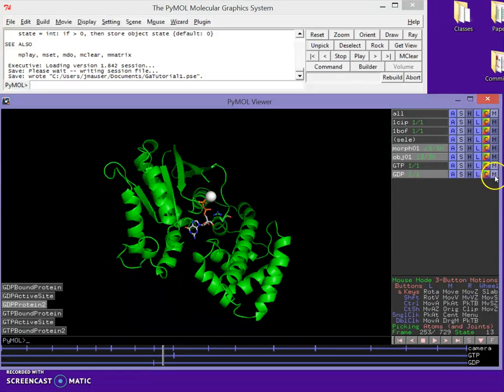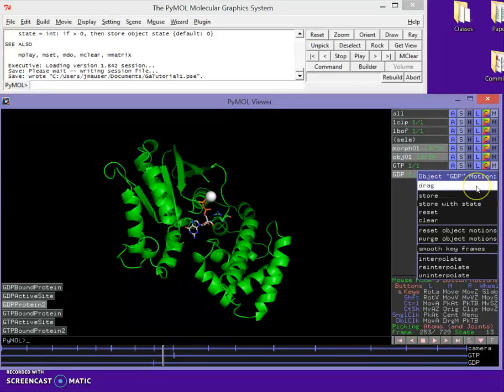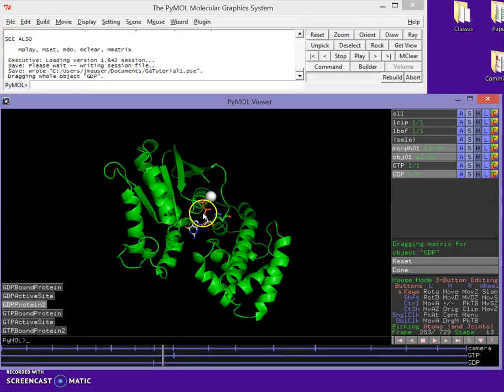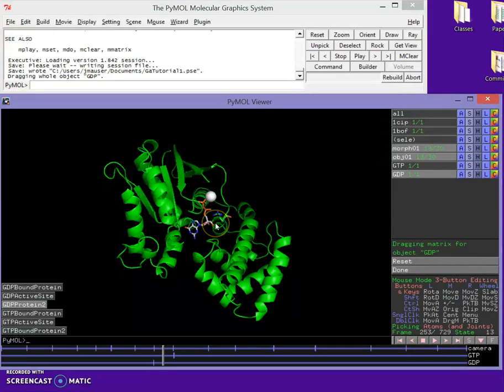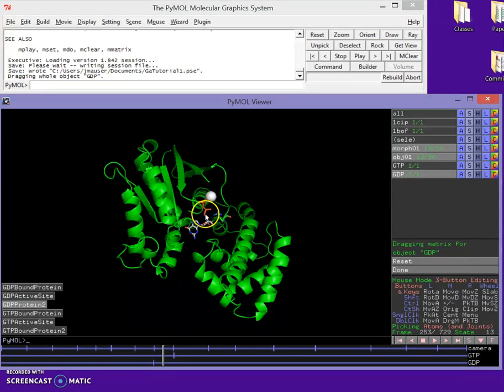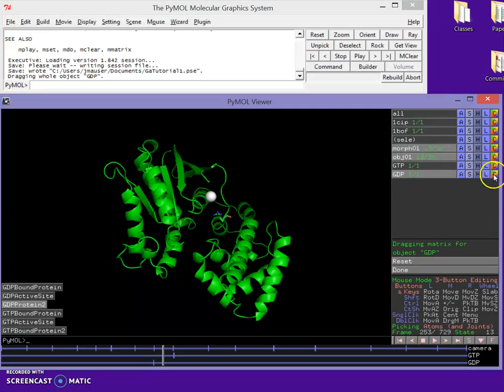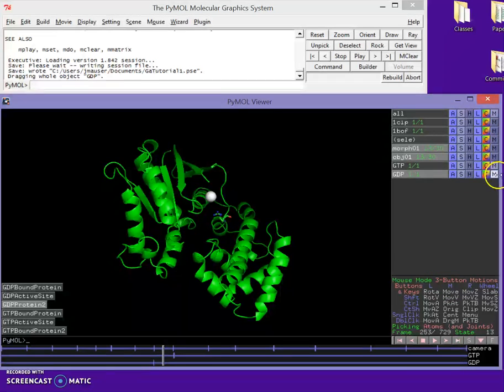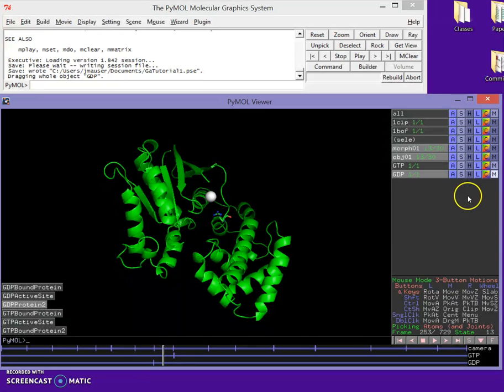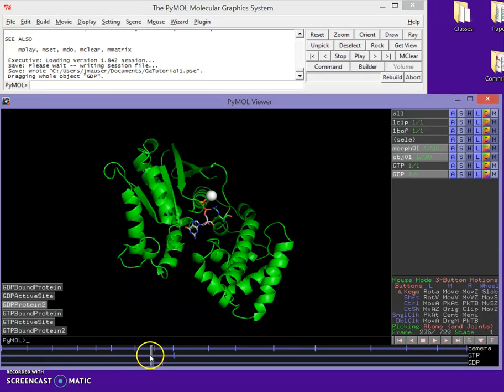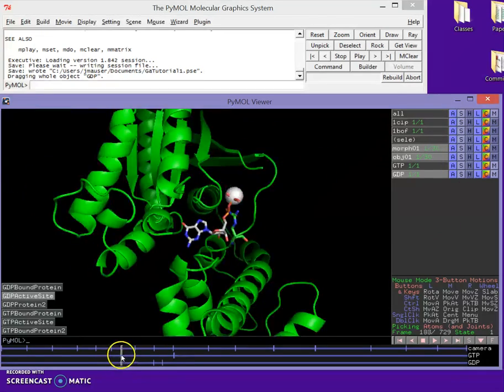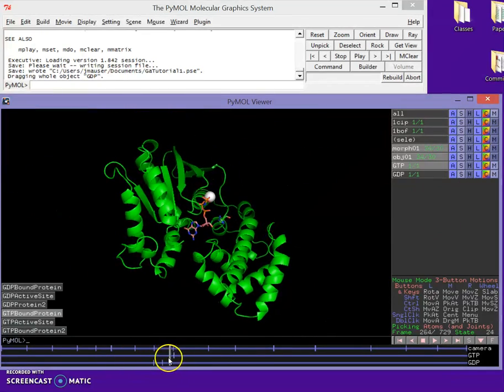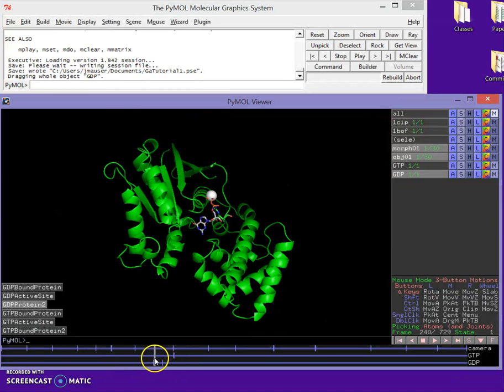So I'm going to go to motions. I'm going to do drag. Now, you have to have a middle mouse button for this. And so there's a number of ways you can do this. But if you have a three-button mouse with the normal mouse wheel in the middle, just clicking the mouse wheel will do it. I'm going to hold down Shift. I'm going to click the middle mouse button. I'm going to drag this GDP away. And I'm going to store it in its new position. Hit Done. And I'm going to store it here. So if you notice, it just flies away.